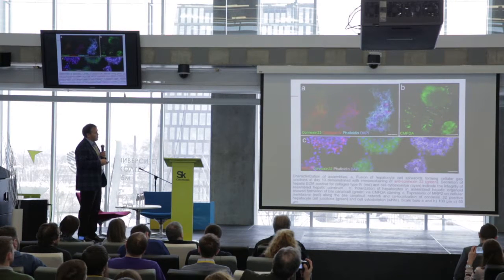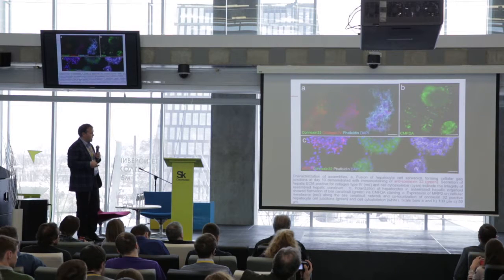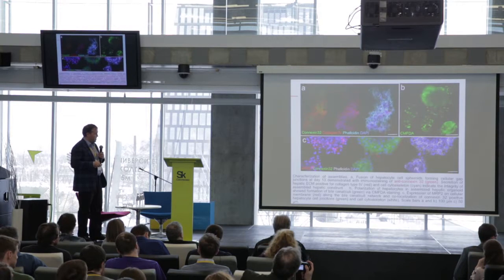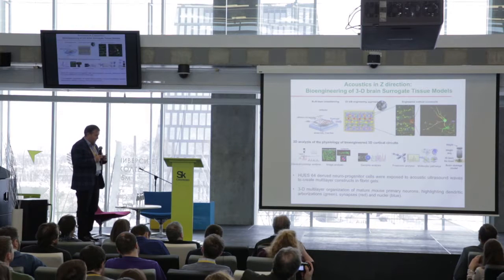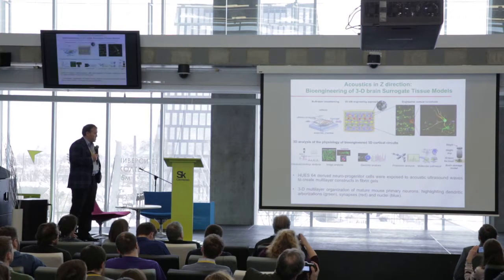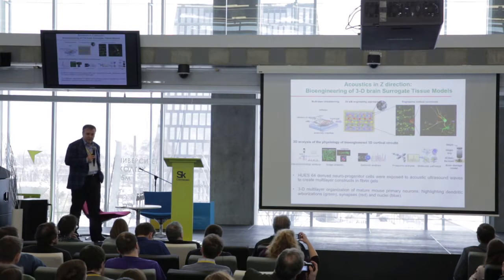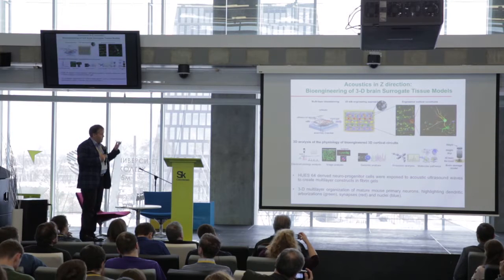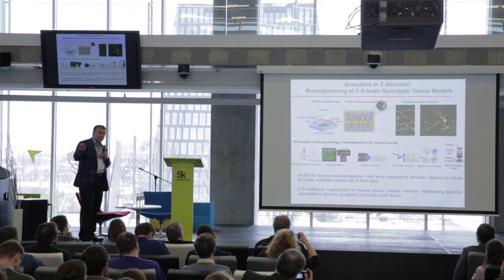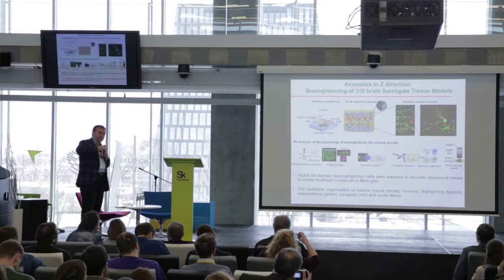And when you look at 2 spheroids over time and you start seeing them form some connections, this is how the merger takes place. And here the space is larger than we usually see. So this is kind of validating our assembly process of tissue spheroids with multiple types of spheroids, of course, in 2D.